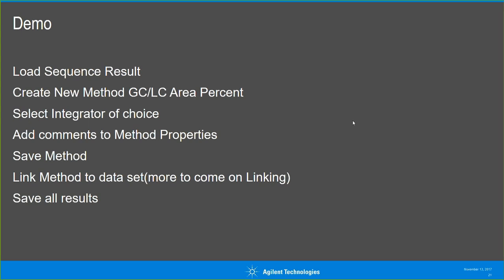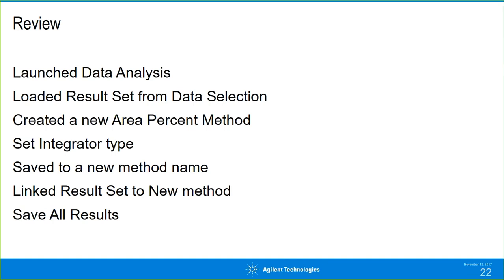Okay, awesome. All right, so we'll just keep going. We'll review what we just did. Okay, so again, I showed you how to launch data analysis. There are several ways to launch data analysis. Keep in mind about desktop icons when it comes to data analysis. Again, those are project specific.